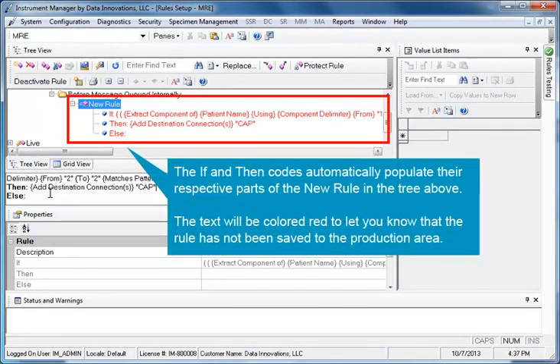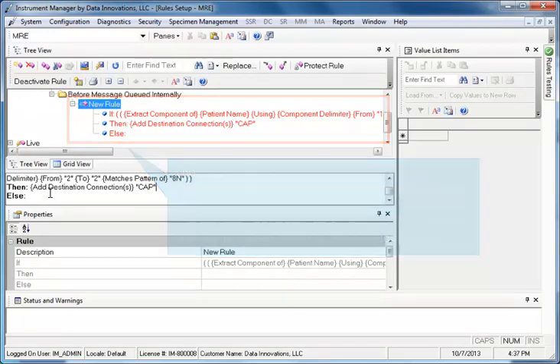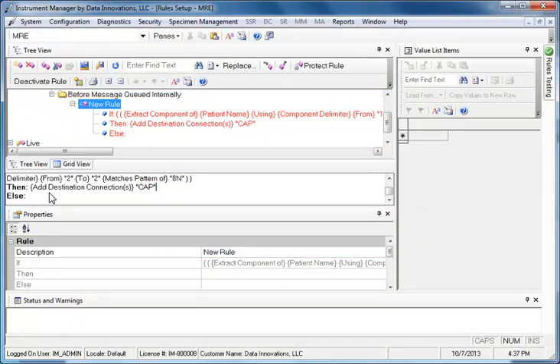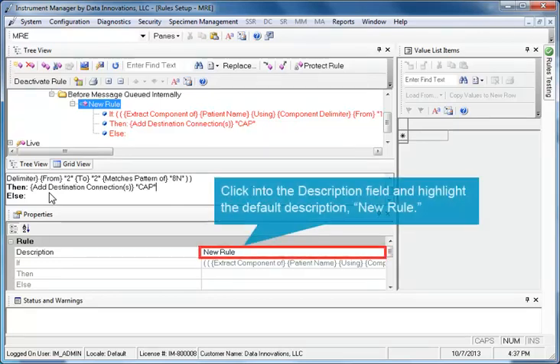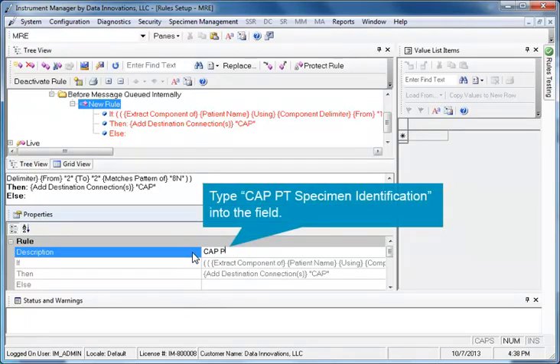The If and Then codes automatically populate the respective parts of the new rule in the tree above. The text will be colored red to let you know that the rule has not been saved to the production area. Next, give the rule a name. In the Properties section, click into the Description field and highlight the default description, New Rule. We recommend you name the rule CAP PT Specimen Identification. Type CAP PT Specimen Identification into the field.